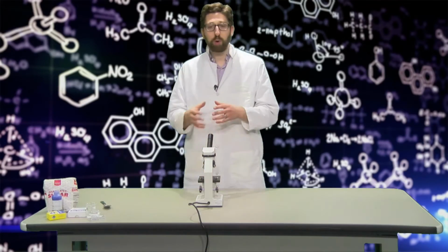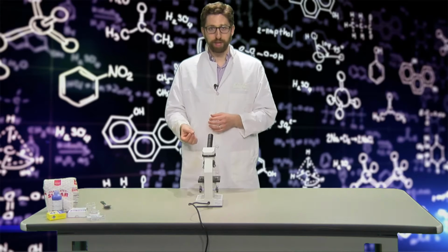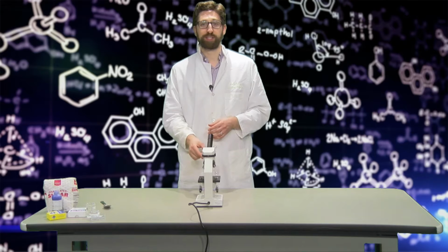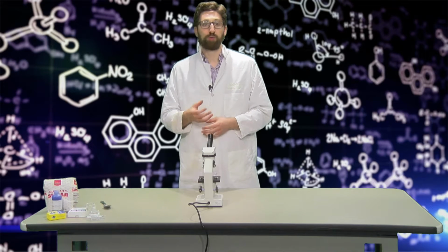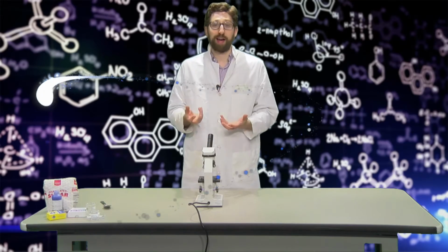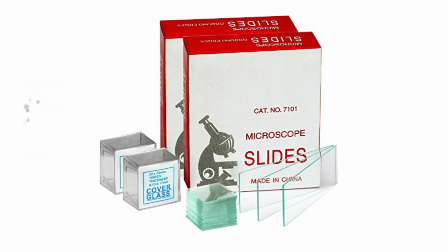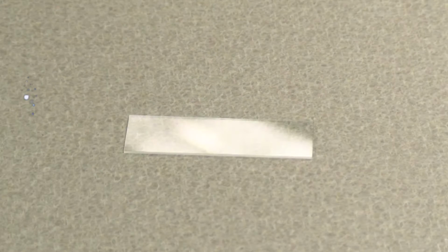Now, you know all the parts of the microscope, but it's time that we actually look at something. We can't just put things on the stage by themselves, then they would stay on the microscope. They could ruin the stage. They could ruin the space where light comes up. You make slides. These are microscope slides. They're made of glass, usually, and they're about this long. Here, I'll show you. This is a microscope slide.